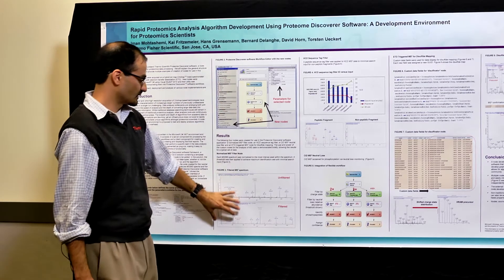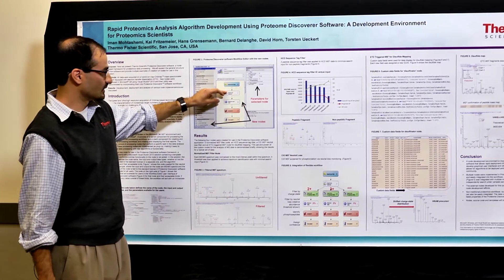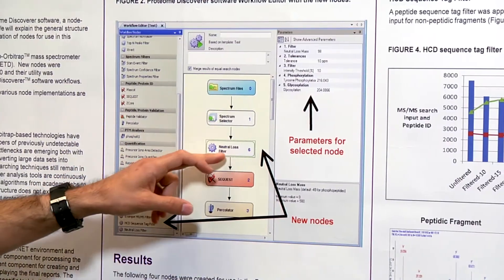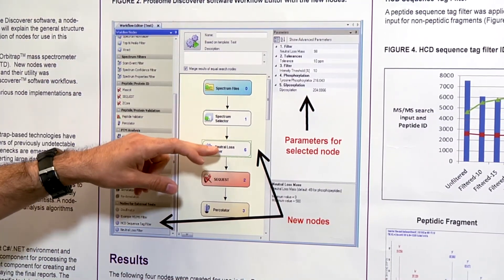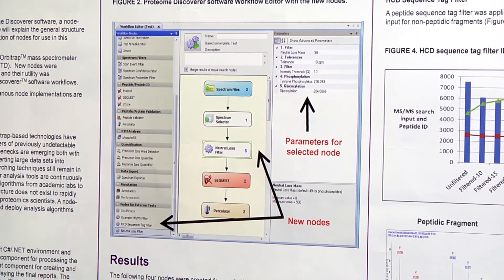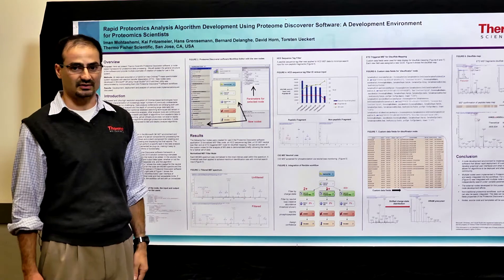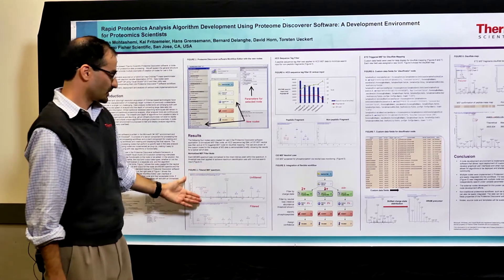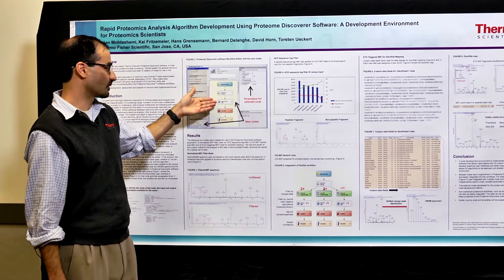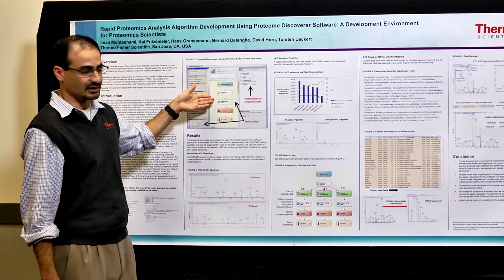Here I have some examples of a neutral loss filter node that is between the spectrum selector and a search node. You can see that when you drag and drop the filter within these two node areas, you can get the output without actually altering any other part of the Discoverer program. The display features and the reporting features are not affected by any node development code that is within this encapsulated region.